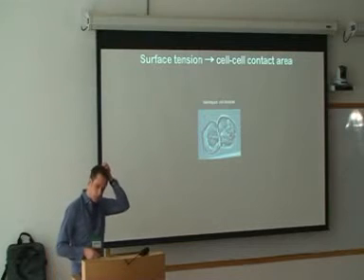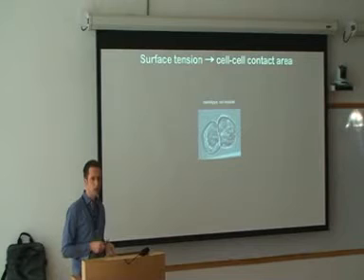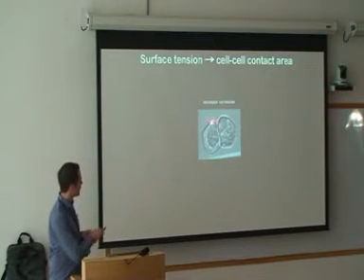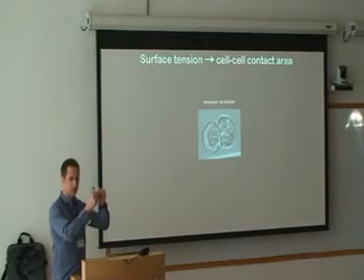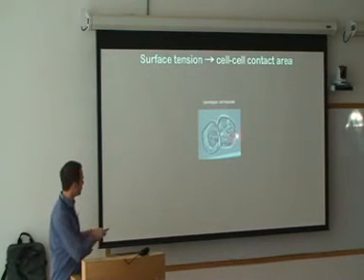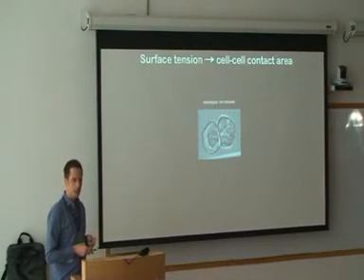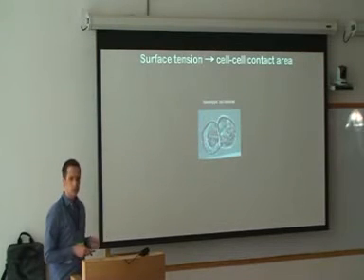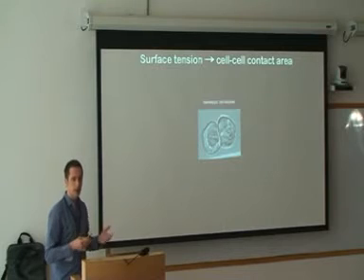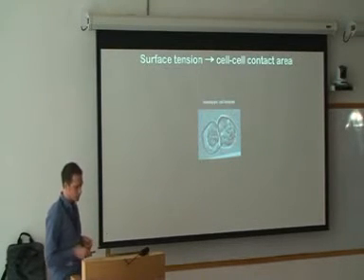And what we assumed is, obviously, if you have a doublet of cells, it's very hard to measure their surface tension because it's too small. But we assumed that if the surface tension of this doublet of cells is increasing, the doublet will try to round up, basically. It will take a round shape. So if we monitor the roundness of this doublet of cells, we learn something about the surface tension of these doublets and possible differences in surface tension between ectoderm, mesoderm, and endoderm, and the underlying cell biology which leads to rounding up and surface tension of these doublets.